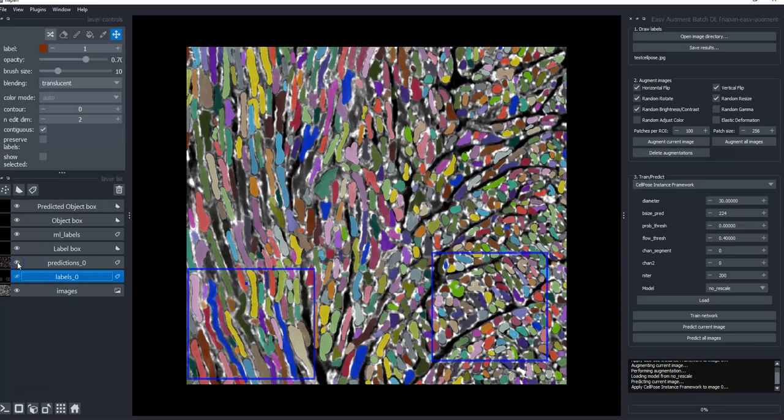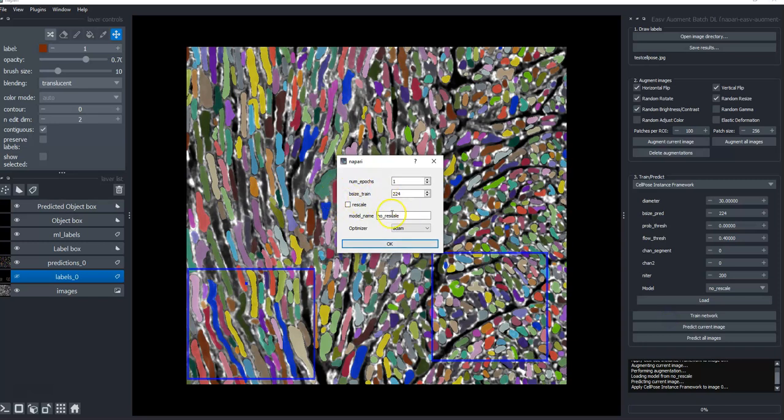So yeah, I hope this video was useful. Again, I don't want to really push people too much into this plugin, which is really a work in progress. Really, the main purpose here is, first off, I need this plugin for other purposes, for some other work I do, so it's a good opportunity to test it, and then I really want to convey this whole issue about rescaling. So when you train a Cellpose model for big objects and little objects, you need to turn off rescaling, and that's the take-home message for this video.